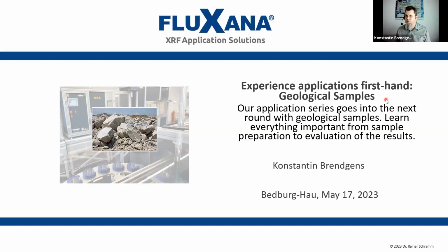Geological samples. So we will have a look at how FLUXANA's laboratory is handling geological samples. And we'll talk about an example from the beginning of the samples itself, over the analytics preparation and so on, to the report. And let's get started right away.